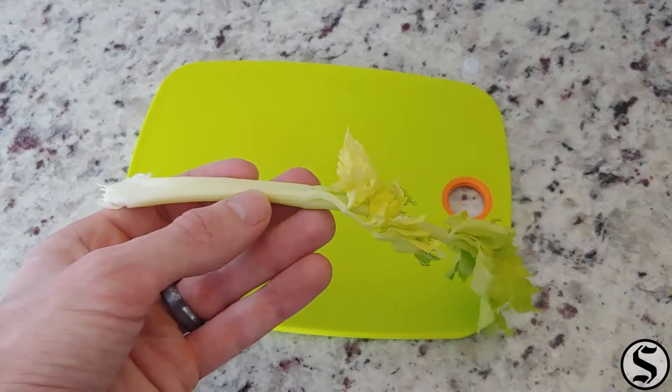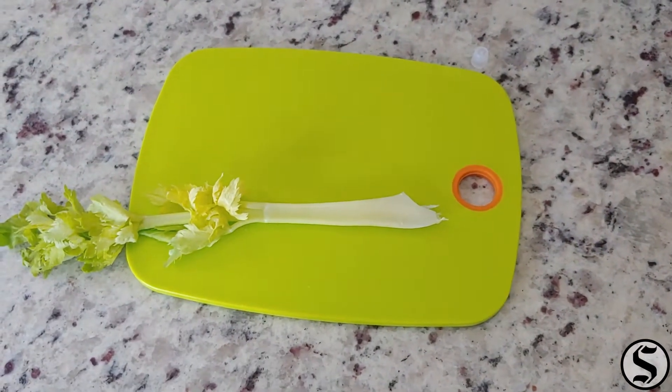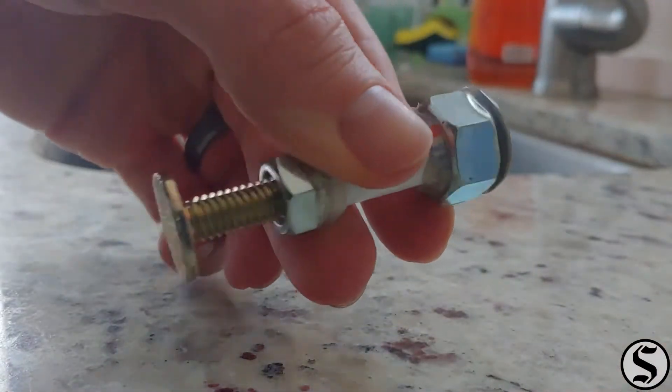Today's sample is a piece of celery. I just had such a good time investigating that carrot that I decided to do another plant.